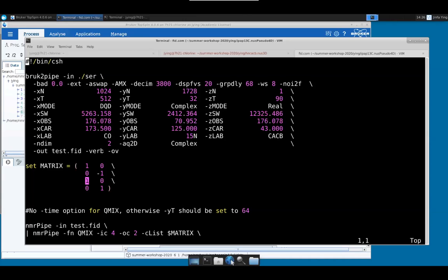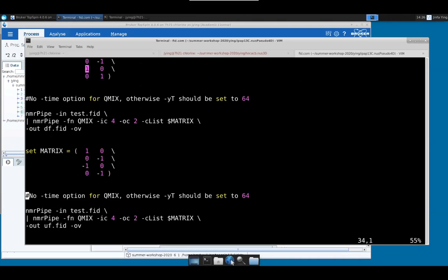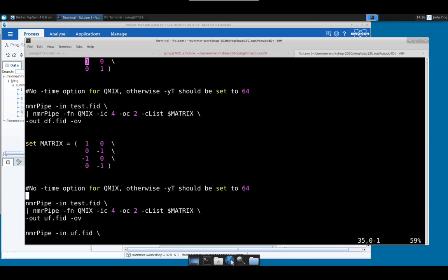The second FID in the output is the difference of the second FID and the fourth FID, okay? That gives you one of the components. If you do another one, taking the difference in the first column and summing in the second column, you get another component. The downfield and upfield components are already co-added for IPAP.